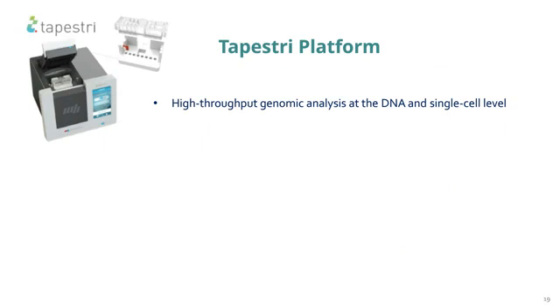Tapestri is a commercially available platform from Mission Bio for high-throughput genomic analysis at the DNA and the single-cell level. It's a targeted approach, meaning that you have to select which regions of the genome you want to sequence.